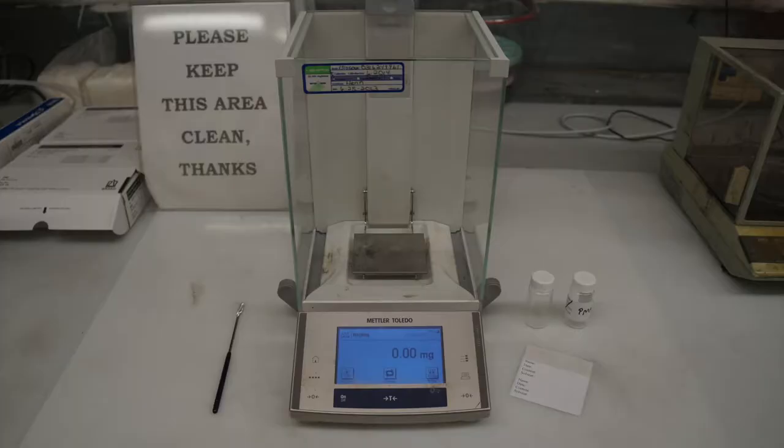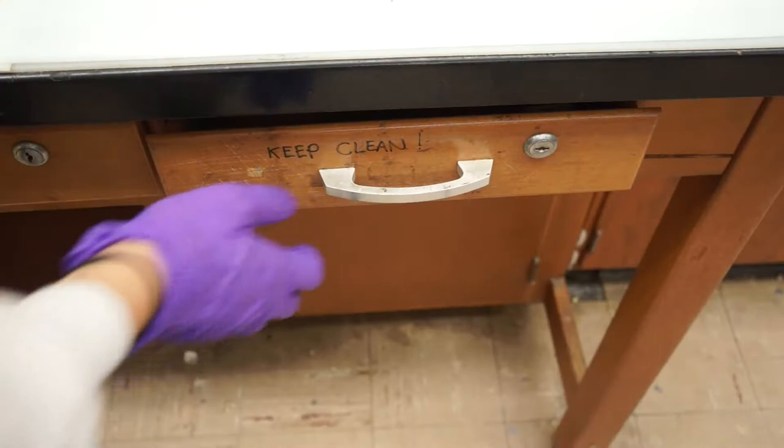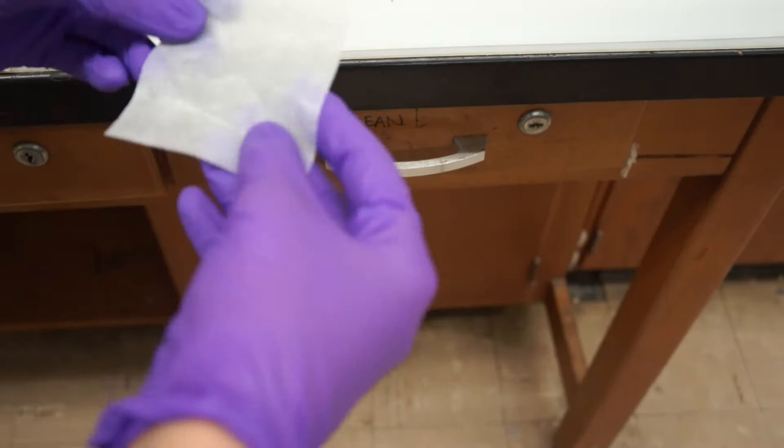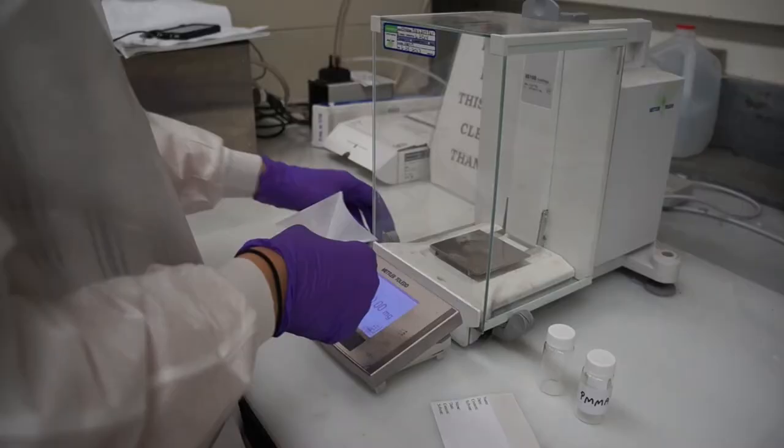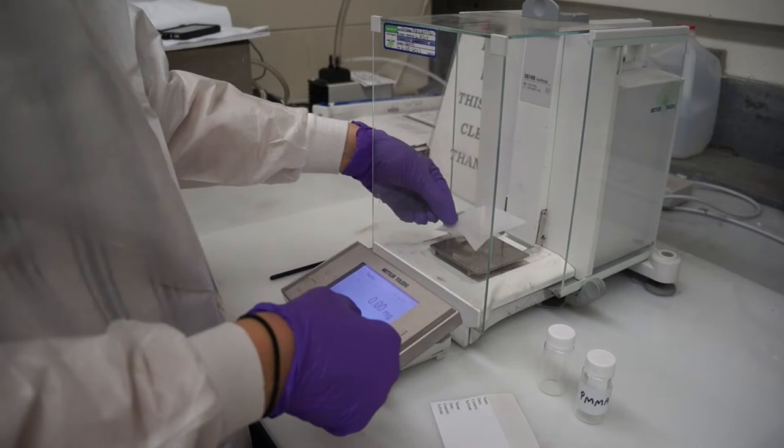Let's weigh an appropriate amount of PMMA for our solution. You'll need some weighing paper. I like to fold it along its diagonals to make it shaped sort of like a boat. This way when you're moving the paper around, the PMMA won't slide off really easily. Now place your weighing paper on your scale, close the door, and zero the scale.